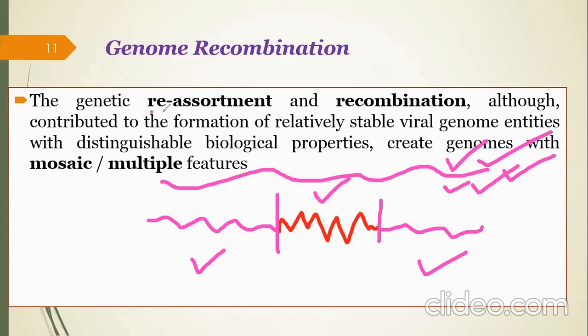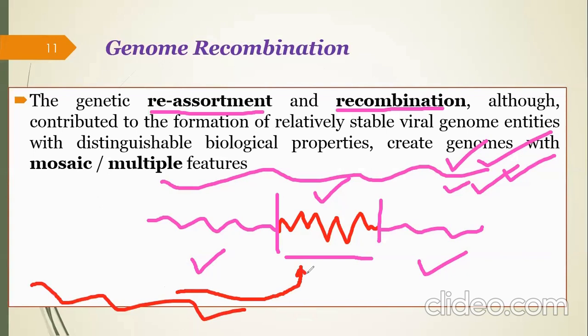So through genetic recombination analysis tools, we can identify which part of the sequence is taken from some other sequence. Like if we have some other isolate, that means this part of the sequence is taken from this parent, and the rest of the sequence is from this parent. So that's how these tools are important, and they give us an idea of the sequence recombination. Like actually these two sequences recombine to give rise to this new sequence.